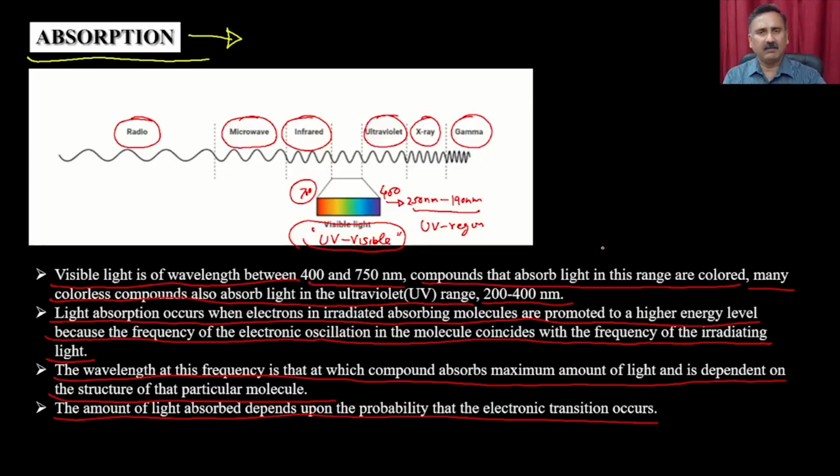And if you recall, a couple of modules back when we were discussing the different types of UV visible spectroscopy, we discussed how you can use spectroscopy for measuring the enzyme substrate interaction, right?